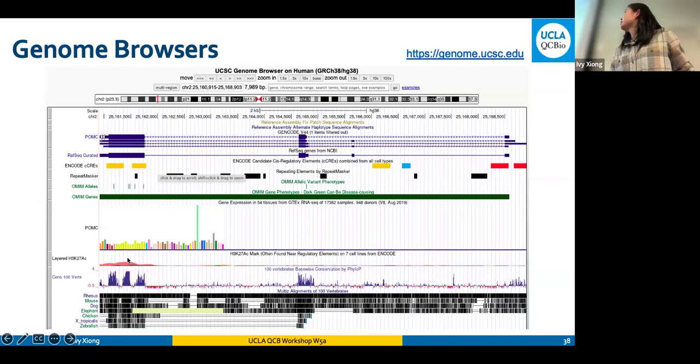But what is useful for this browser is that you can load different additional modalities. For example, people have done epigenetic sequencing, looking at methylation, acetylation, other data, or you can look at transcription factor binding data. You can load into this one browser on top of your data, or alongside your data. So you would be able to make inferences.